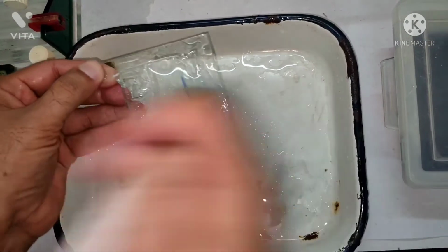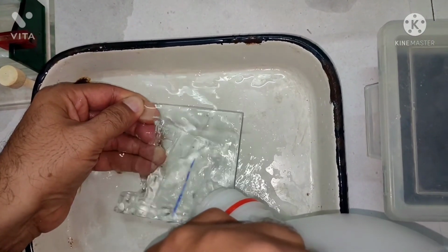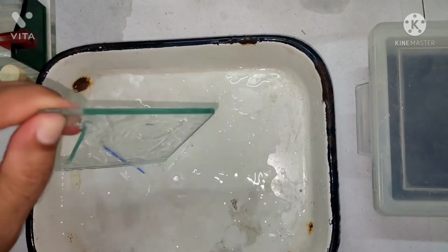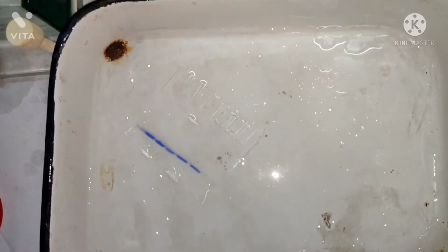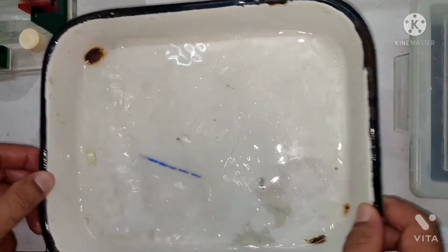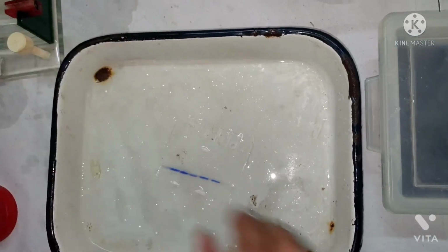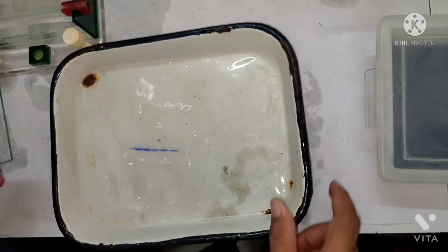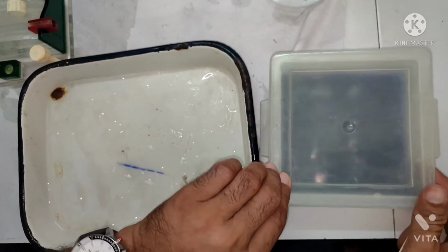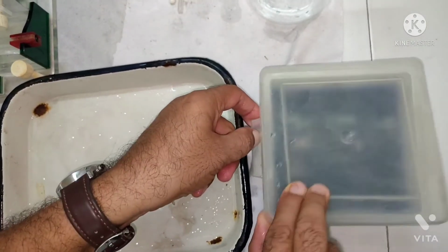All right, so now I'm putting some water here, right? And see, now our gel is there in the tray, right? So now almost the washing process is completed. This is the washing, right? And now I transfer this gel into the staining solution and will keep it overnight.